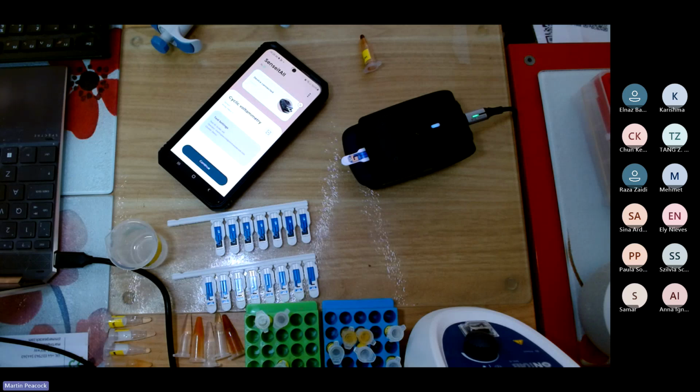I can see the oxidation of Sudan Red, but very little evidence of a reduction of Sudan Red. Why is that? Because Sudan Red has an EC mechanism. So I just want to demonstrate a non-reversible system on a screen-printed electrode.